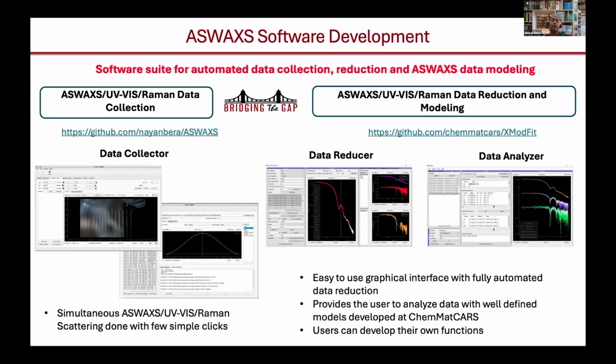We are putting a huge amount of effort into hardware and software support. We have developed a data collector which combines the UV-Vis, ASAXS and Raman scattering data together.